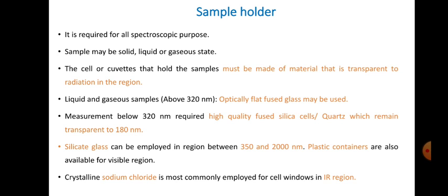If I am using glass, glass strongly absorbs UV light, so I cannot use a glass sample holder for measurements in the UV region.